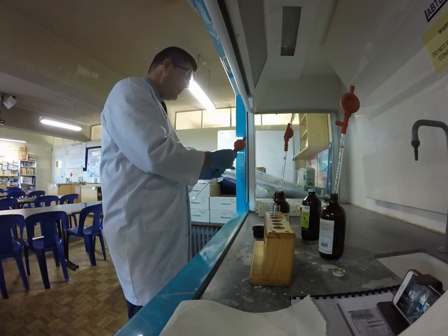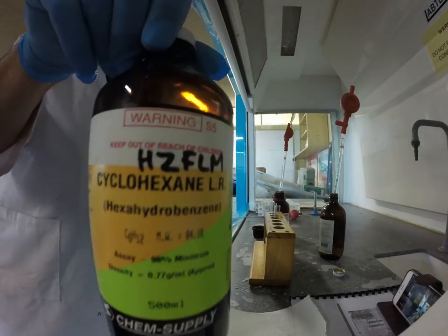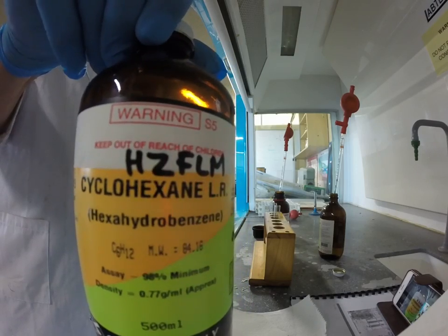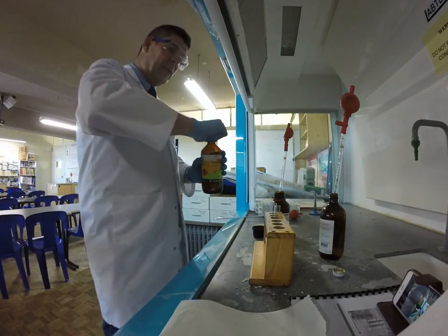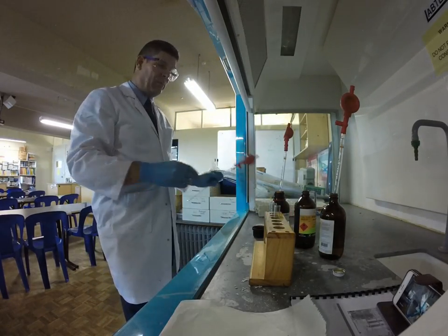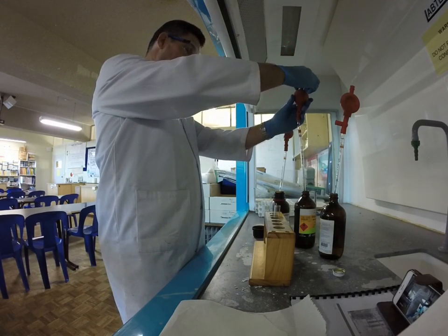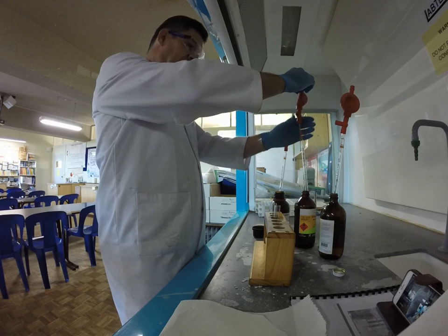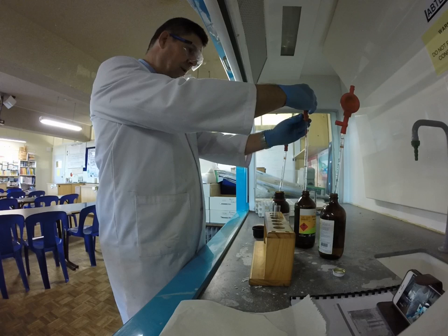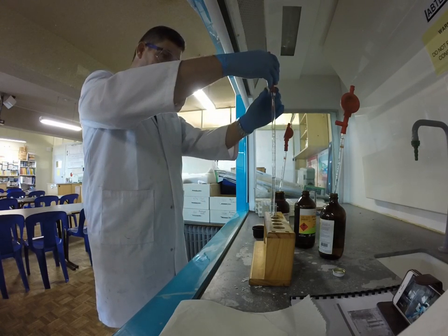So does the same thing happen if we use an alkane? Our alkane is cyclohexane. Now the problem with these organic hydrocarbons is they are very flammable — that's one of the reasons I'm using the fume cupboard, and also why I'm keeping Bunsen burners and any other naked flames away. I'm going to draw up some of this liquid and transfer a little into the third of my test tubes.